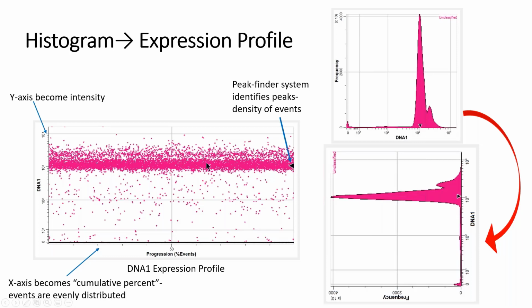This particular profile is called a constant profile. And there are some cell types that will only use constant profiles for enumeration. At this point in the modeling, when a raw data file is added, the events are actually in acquisition order, so you can see if there are any problems like clogs or bubbles during that acquisition.